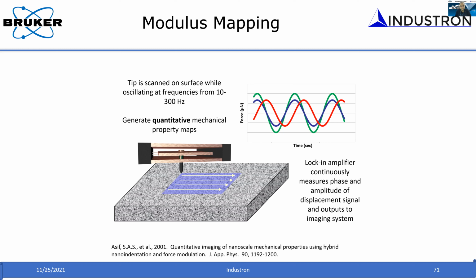The load divided by area gives the stress. So you have to convert the load into stress, and the displacement to strain. Normally we use a spherical probe to get the stress-strain. Yeah, you can use a spherical probe if you want to continuously measure the stress-strain response. But you can also use different geometries.